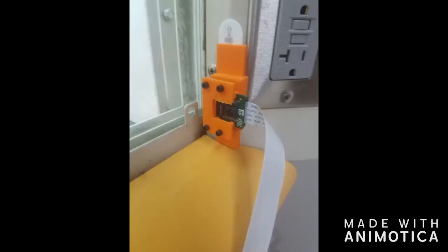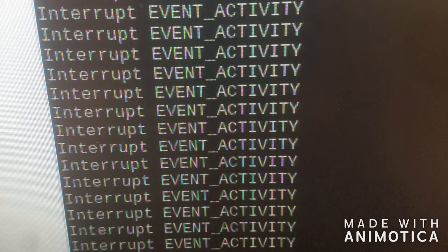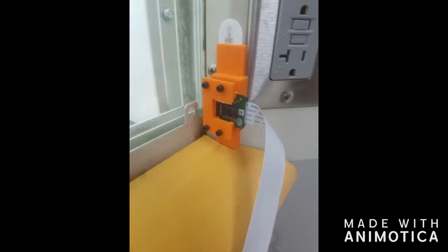The user detection system, which has not been modified since the previous prototype, involves a Raspberry Pi with a camera mounted to the bottom corner of the opening. During installation, the installer tells the camera which region of the screen represents the inside of the fume hood. During normal operation, the Raspberry Pi scans frames for significant changes in pixels within the specified region, which indicate user activity. Whenever activity is not detected for 5 minutes, the sash is closed.